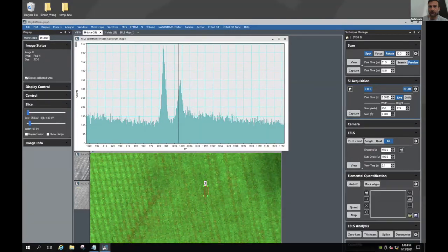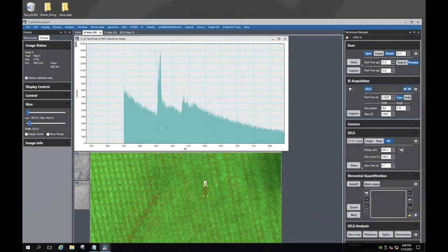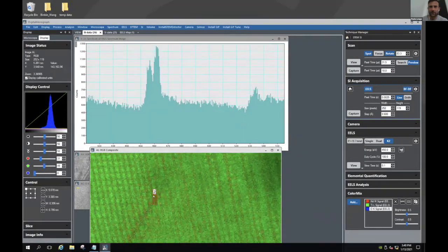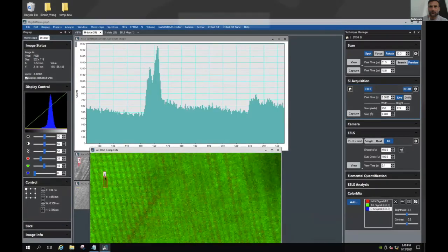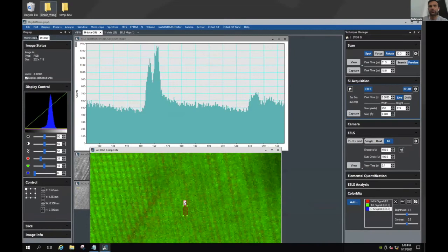Same thing with titanium. You can even focus on the titanium. We could do one across the interface and show the oxidation change. Oh yeah, that could be the next experiment. So you see, surprisingly there, yeah, you can just go around and see, but obviously going from the STO to this region, you see a big change.